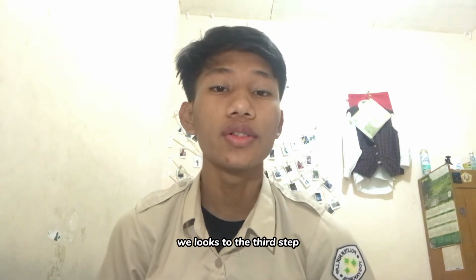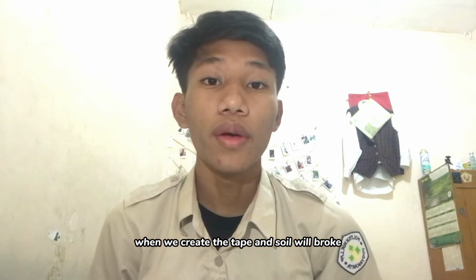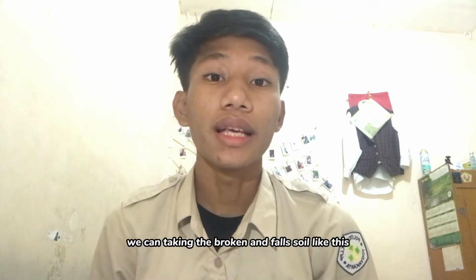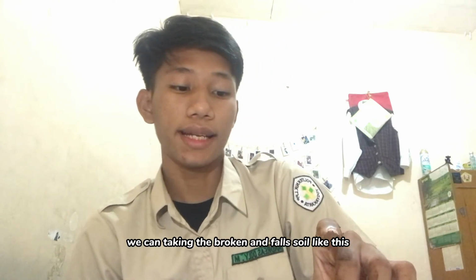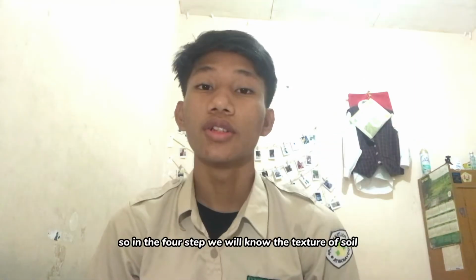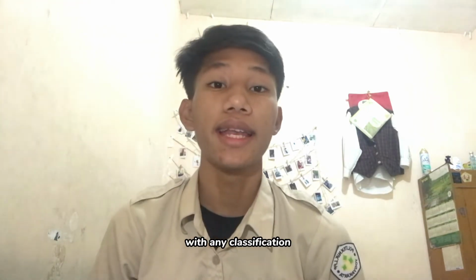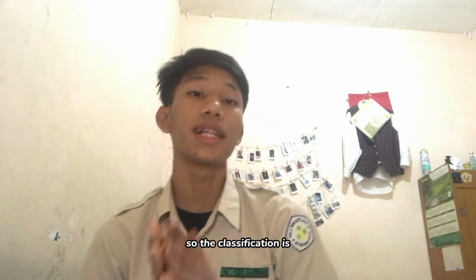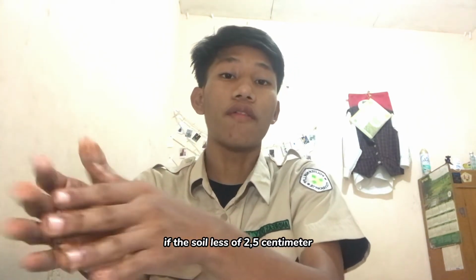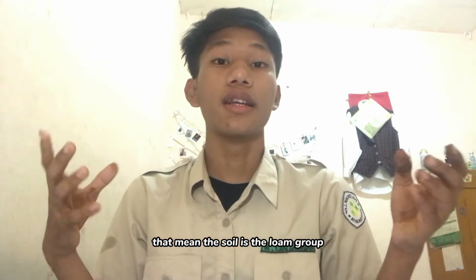And the next step, we look at the third step. When we create the tape and the soil breaks and falls down, we can take the broken, fallen soil like this, and we can measure the length of the soil with the ruler. So in this step, we will know the texture of soil with the classification. The classification is, if the soil is less than 2.5 cm, that means the soil is the loam group.